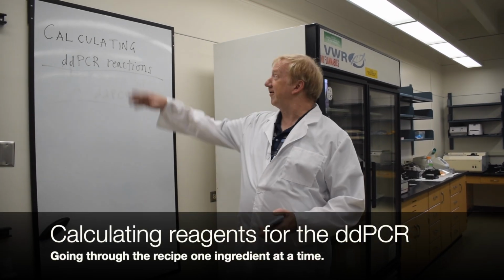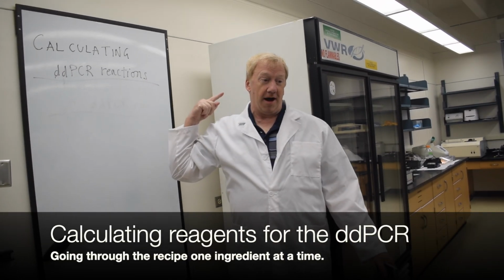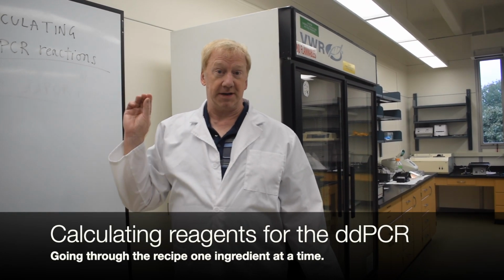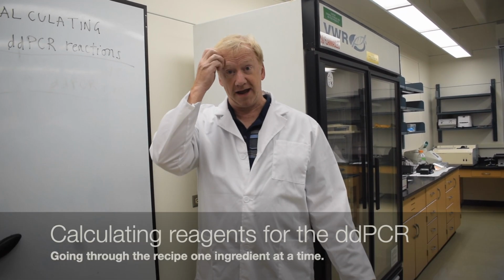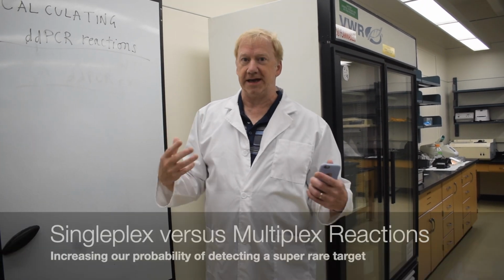Okay, so we are going to calculate what goes into our ddPCR reaction. The problem we have today is that we have a rather complicated reaction because we have two different conditions. We have a singleplex reaction and a multiplex reaction, so we need to take that into account.